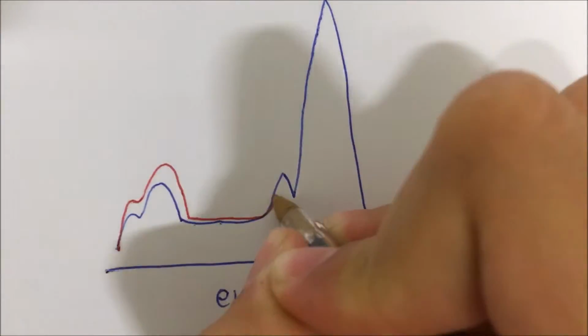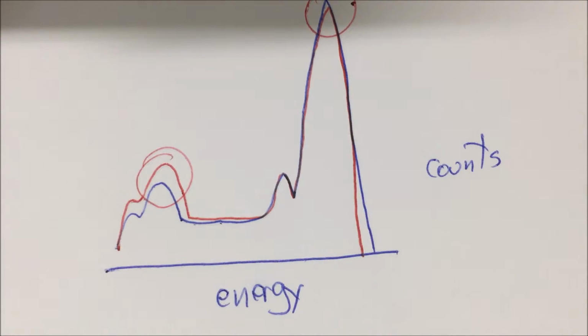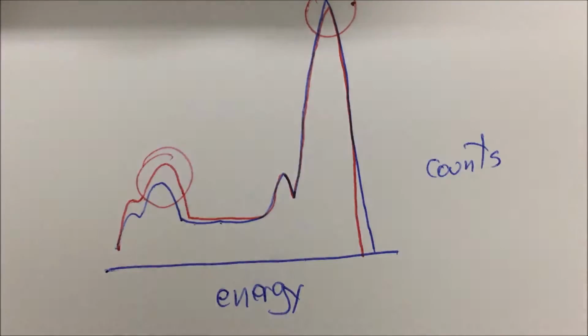The most interesting parts were the peaks, which sometimes showed differences. This is gallium, this is nitrogen. While the results were not exactly what we were expecting, we still got some useful information out of this.